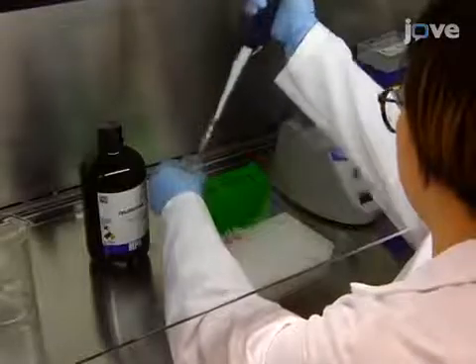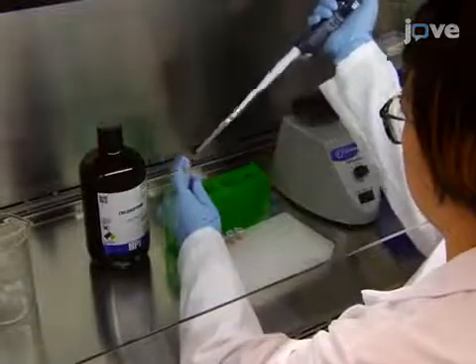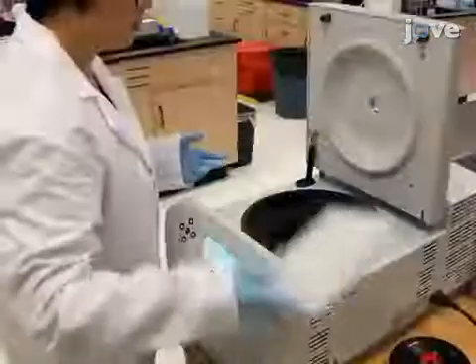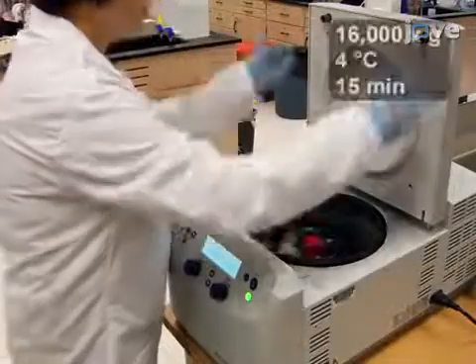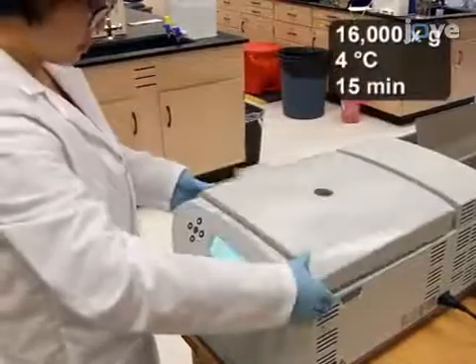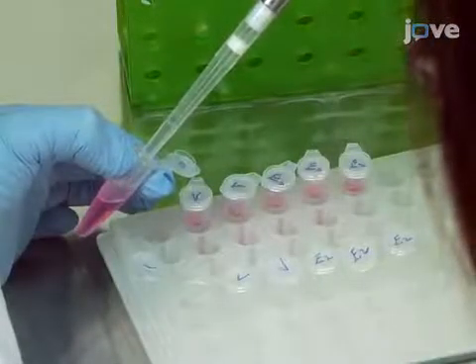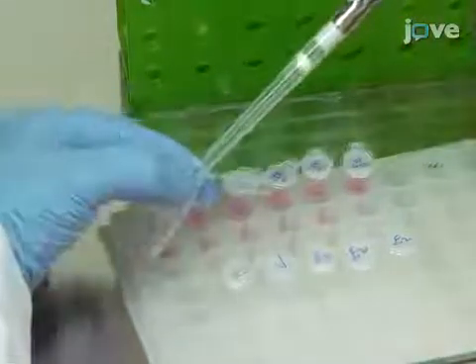To isolate the RNA, add 200 microliters of chloroform to 1 milliliter of cell lysate and vortex for 10 seconds. After incubating at room temperature for 5 minutes, centrifuge the samples at 16,000 times G and 4 degrees Celsius for 15 minutes. Following centrifugation, carefully transfer the aqueous top phase to a new tube.